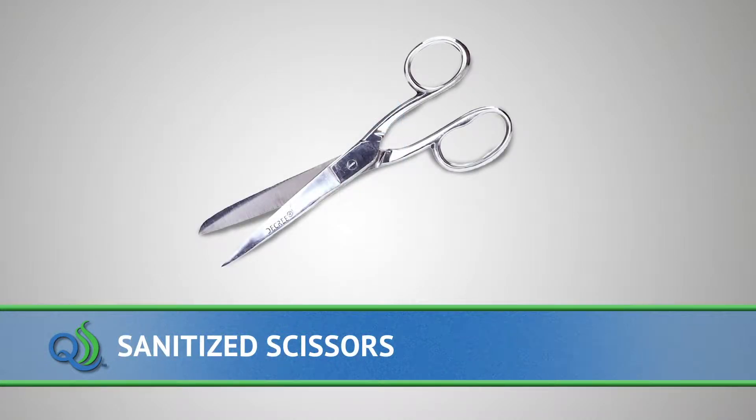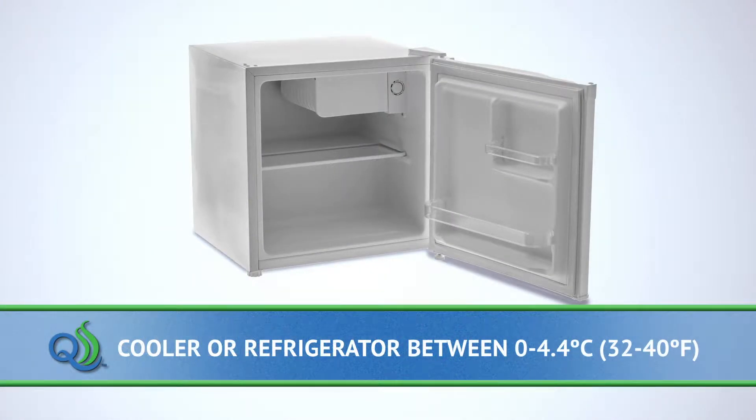Finally, you'll need a refrigerator or cooler with ice and water to keep the sample at between 0 and 4.4 degrees Celsius as required by PMO regulations.